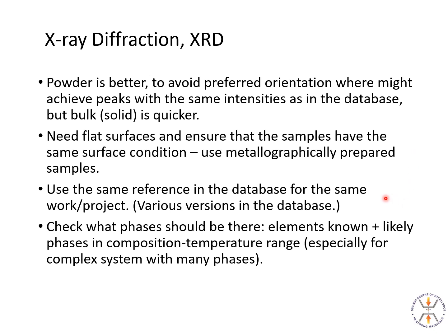And very important, for your phases, use the same reference for the same work or project, so you're not referring to different references for the same phase, because there's going to be various versions in the database, and when you check which one you want to use, make sure it doesn't say replaced by and give you another number. Very important to do that. And then you check what phases should be there. You know the elements, hopefully.